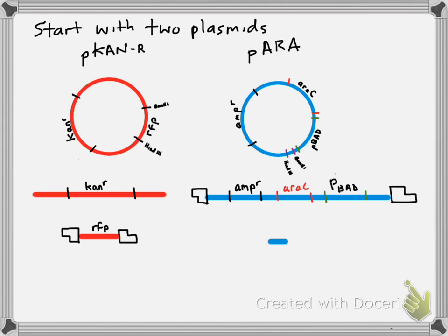with the sticky ends to actually join together and form a new recombinant plasmid that we can then get into the bacteria and have the bacteria transcribe and translate the RFP gene, and actually we can confer a new trait on that bacteria and hopefully see it glow red.